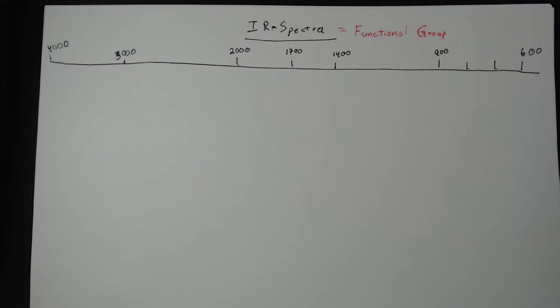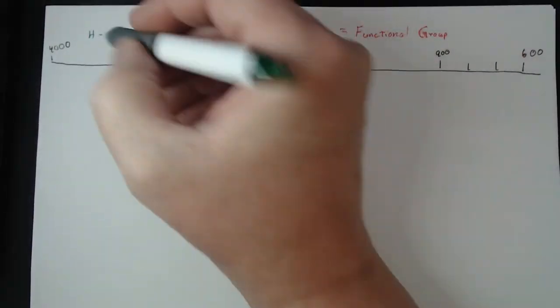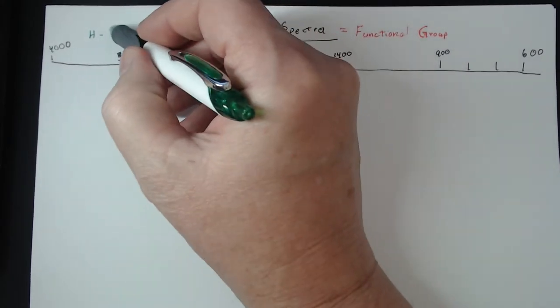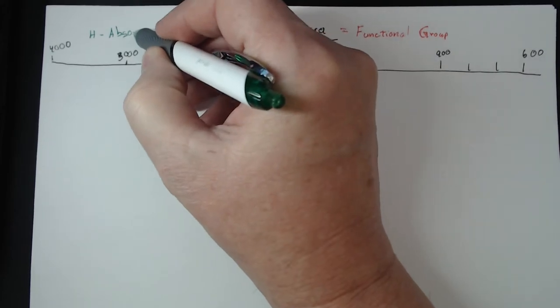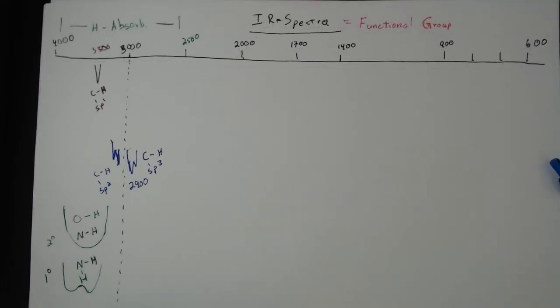The first zone you need to be aware of is the hydrogen zone. All of the hydrogen absorptions for all types of functional groups always show up somewhere between 2,500 and 4,000. Since hydrogens are a fundamental part of organic chemistry, we should be able to quickly identify different types of hydrogen just by glancing at the graph. The first types are the most common — the carbon hydrogens. The 3,000 line is a very important dividing line. The most common carbon hydrogen peaks are either on the 2,900 side or on the 3,000 to 3,100 side.